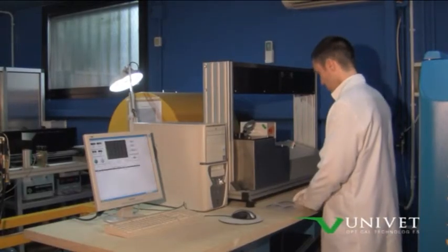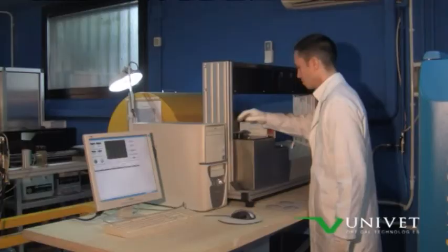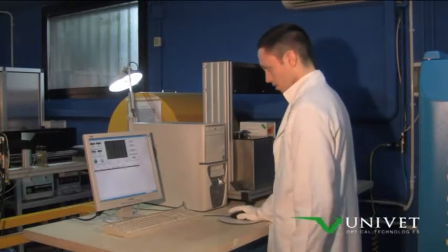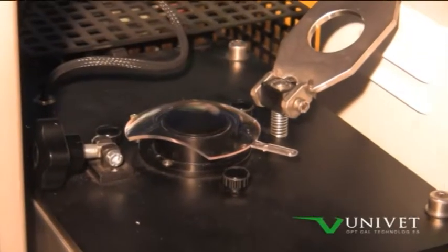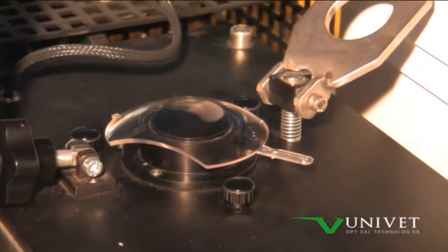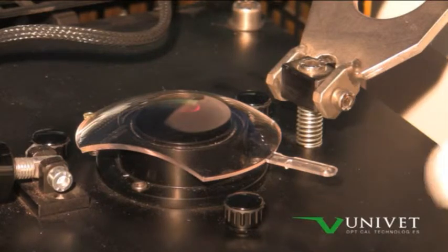Resistance to fogging of oculars is tested by using an optical system, capable of measuring the period of time necessary to have the lens fogged. Samples shall be conditioned prior to testing by immersion in water for one hour, followed by a drying phase at room temperature for a period of 12 hours.